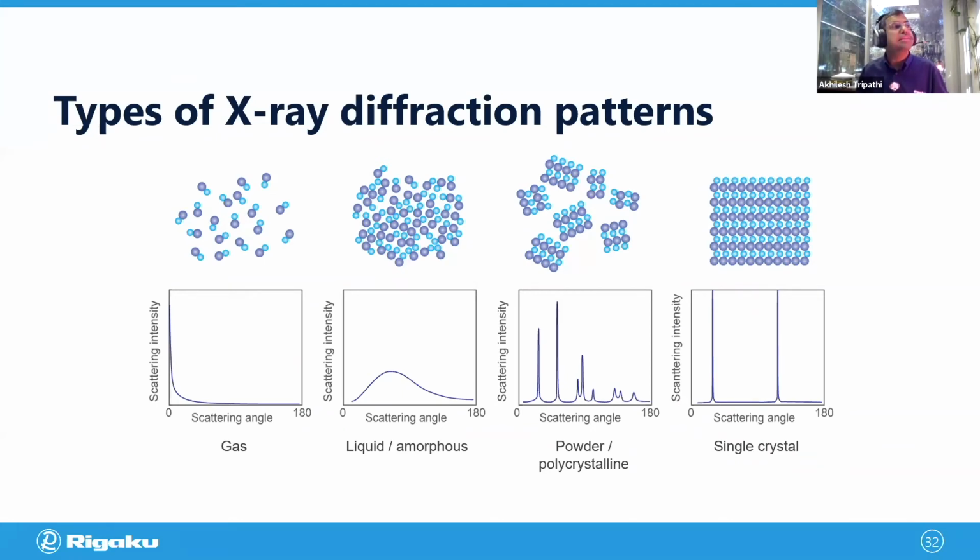However, if you bring a single crystal, something like, let's say you have a piece of diamond in your jewelry, it has to have the right orientation to satisfy Bragg's law, because you are trying to see just one of those planes. And that's why you have to keep rotating it, either automatically or manually, to see a peak. So that's what is called single crystal. And then there is another way to find the structure. The second cartoon shows a liquid or amorphous.